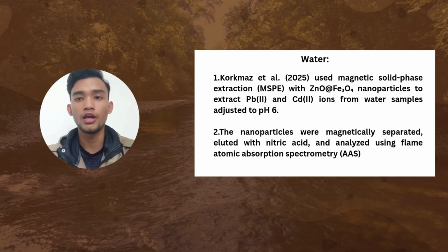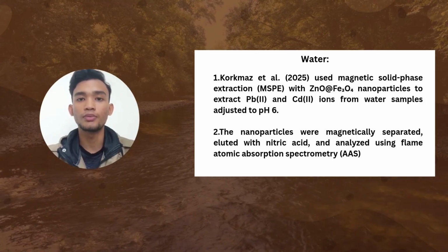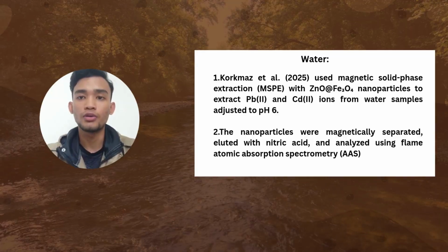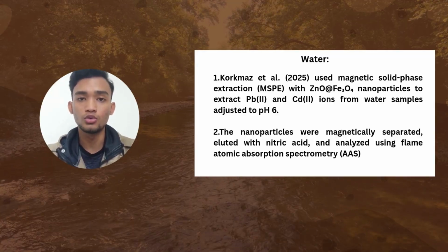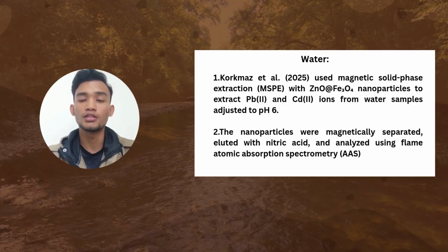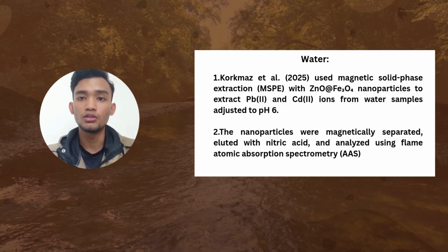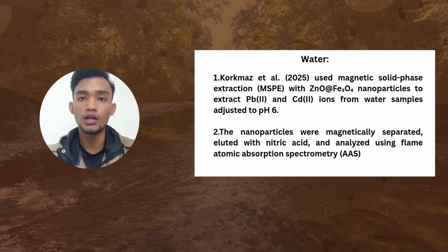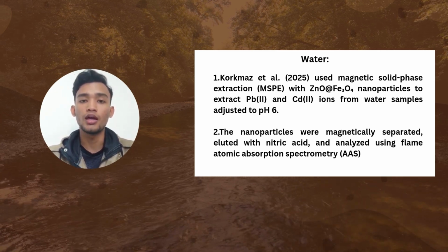For magnetic solid phase extraction, MSPE, nanoparticles were used to extract Pb2+ and Cd2+ ions from water samples adjusted to pH 6. And the nanoparticles were magnetically separated, eluted with nitric acid, and analyzed using flame atomic absorption spectrometry, AAS.